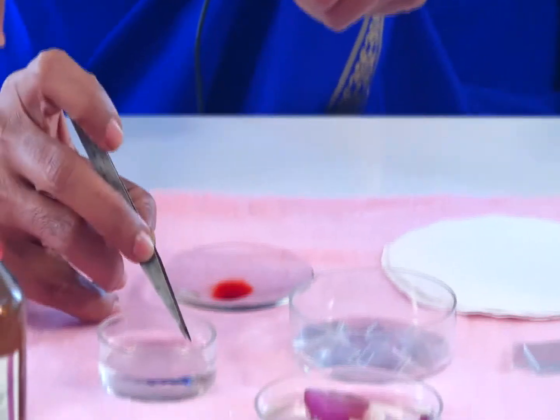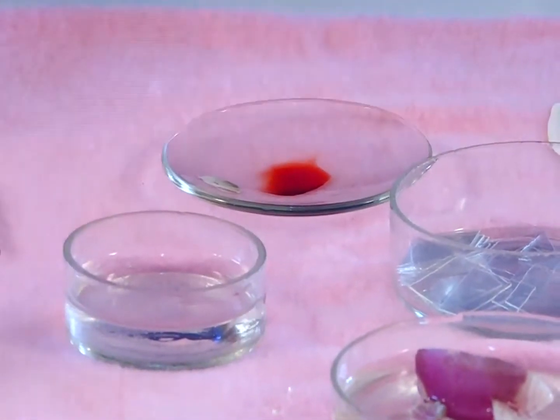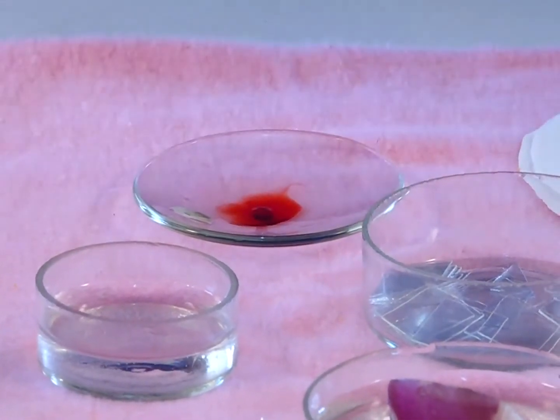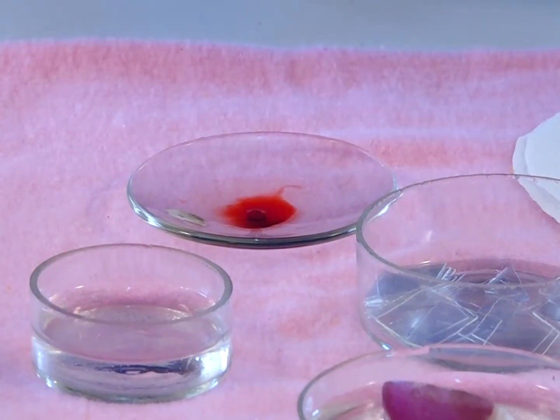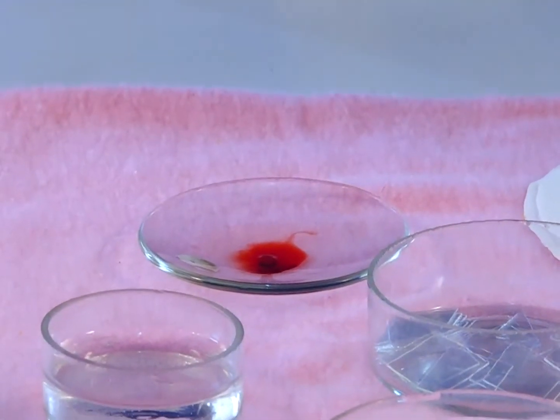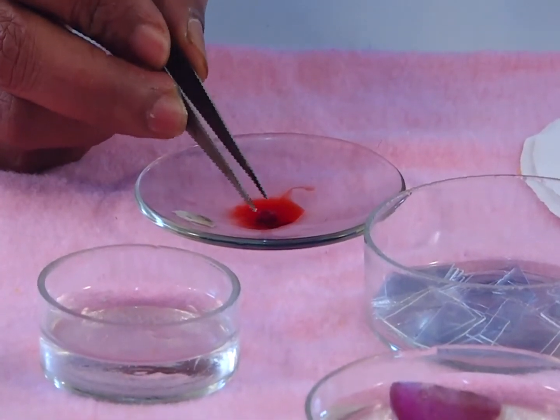See the material. Take that material and with the brush, transfer it into the stain. Wait a few seconds so that the material absorbs the stain. After a few seconds, take out the material from the Aceto Orcein.